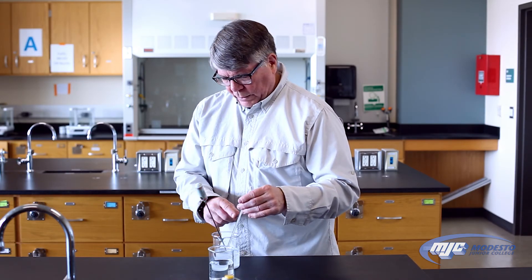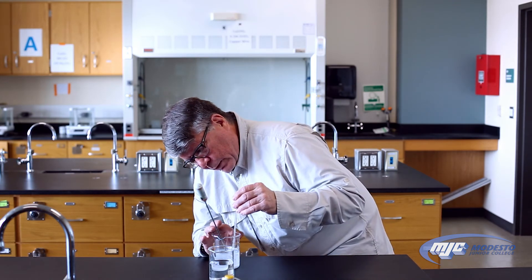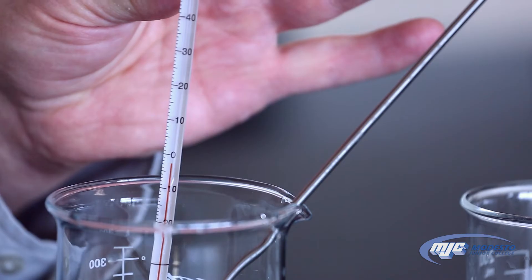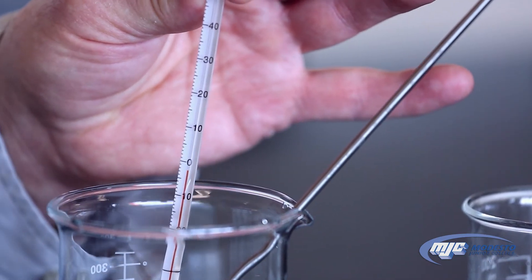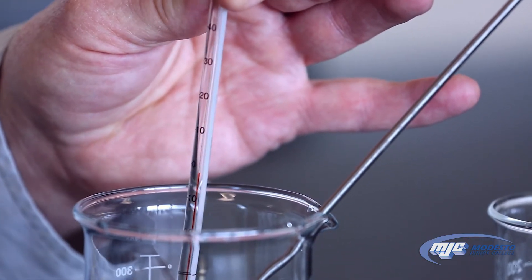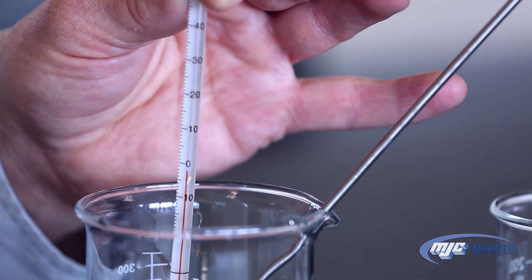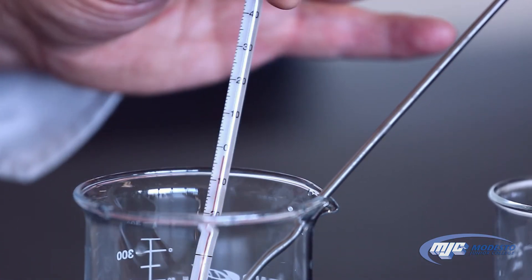So if we were to read this temperature right here, there's the top of the red line and it's below zero — you see the zero right there? So that means it's negative. It's between negative two and negative three right now, so I'd call this maybe negative 2.4 or negative 2.3 degrees Celsius.